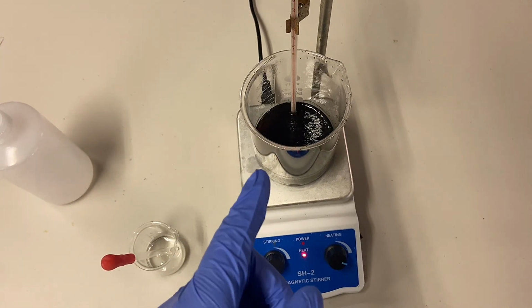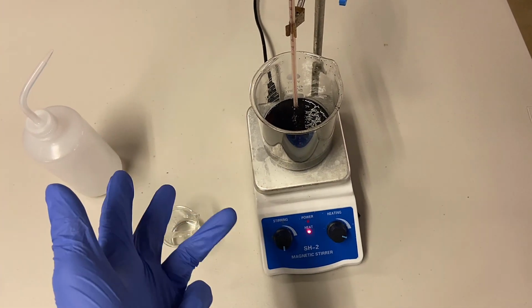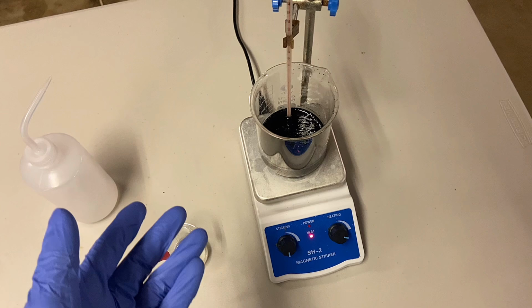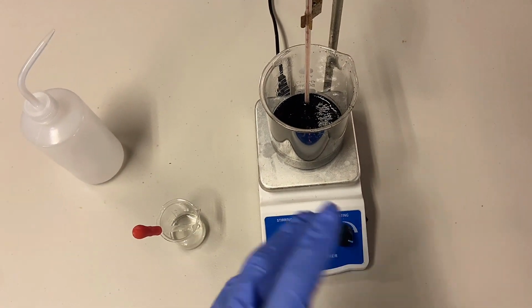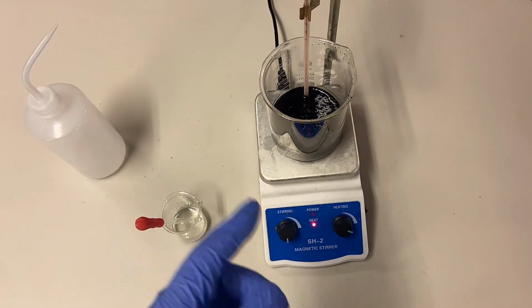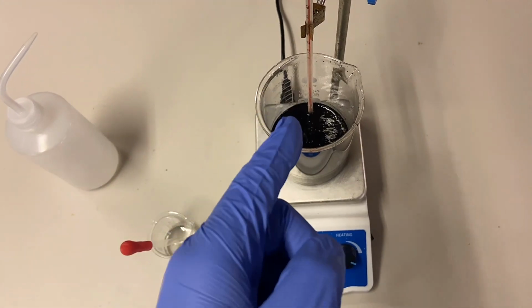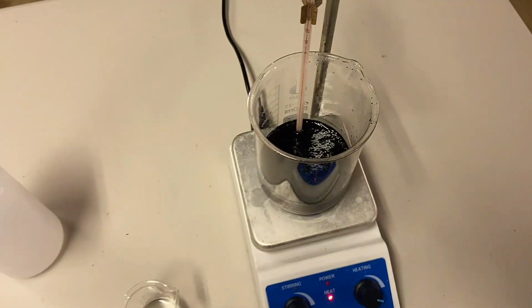And what that's going to do is it's going to break down all of the oxides, so the nickel, the cobalt, the lithium, and the manganese that's all in that black mass, and it's going to turn it into essentially a liquid. And from that point, I'm going to filter it, get rid of any of the excess graphite, and then I'm going to start doing the step-by-step extractions. And this video is going to focus on getting the manganese out of this mixture. But before I can do that, I need to dissolve it completely.